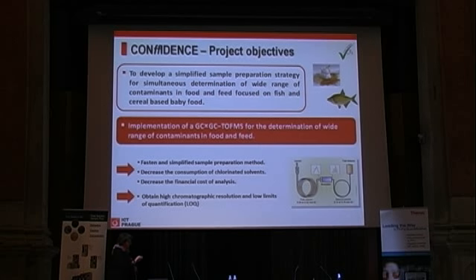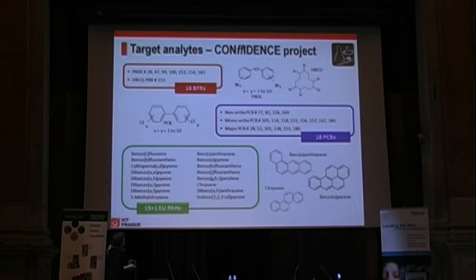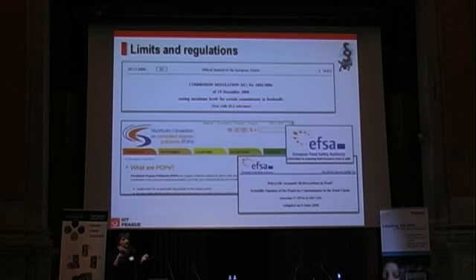Okay, the target compounds. So there are many requirements for regulation, and chlorinated compounds like PCBs or brominated flame retardants, and also 16 or 15 plus 1 PAHs were our list of target analytes. So this is where we started. And at that time there was regulation with requirements for LOQs and the other performance characteristics we had implemented in the target performance. But during the time there were some developments, and improved LOQs were required in the meantime.